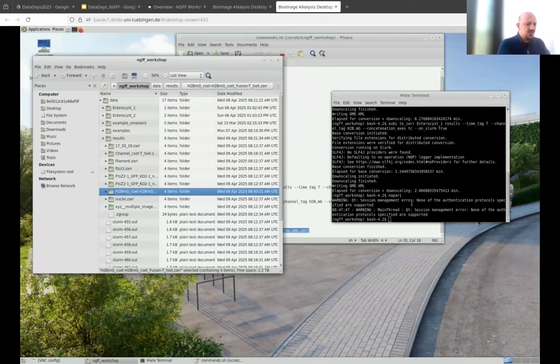I can show you that, but for local images, when you have local OME-Zarrs like you have here, you can also use what's called the ome-zarr-py library. It's a Python library. It also gives some command line utilities. And in these command line utilities, it also integrates this NGFF validator. So it works like this. You simply type ome-zarr and then view. This is the right command. And then provide the path to the OME-Zarr that you want to validate. So you can simply choose this one again.